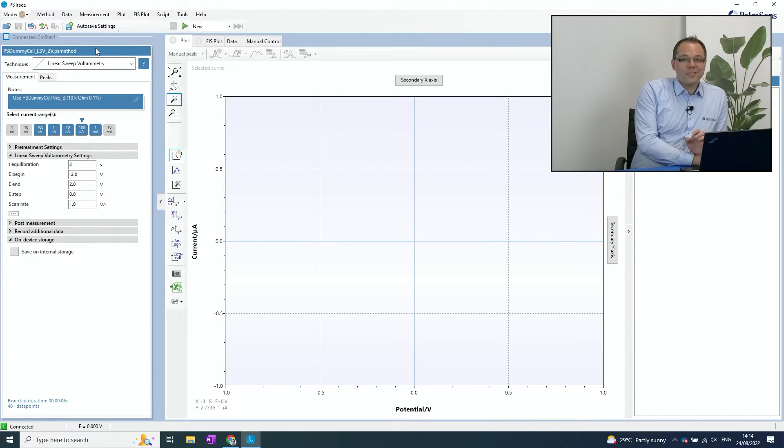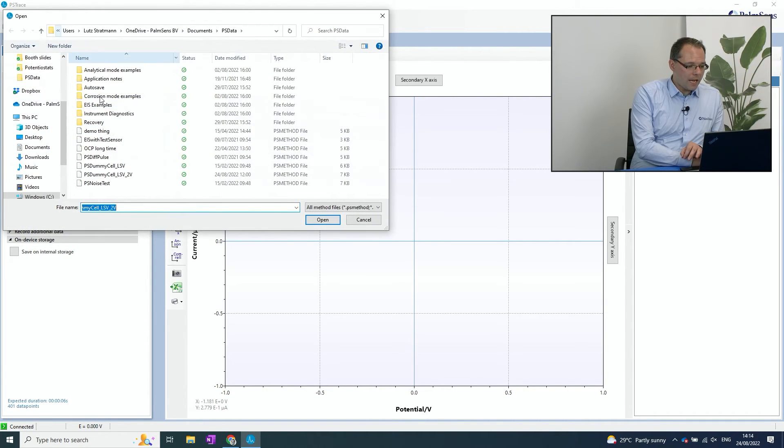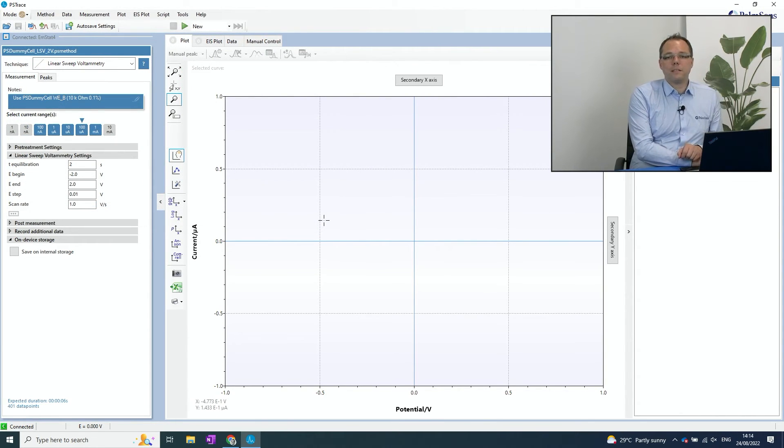So to set the parameters in the software for this first measurement, we will just load a method file. A method file contains all the parameters that you need for a measurement. It doesn't contain the data of a measurement itself. So to load such a file, I just choose Method, Load and pre-installed already in the Documents PSData folder, you will find the method file that we want to use today, which is PSDummyCell LSV 2V. I open that and all the parameters are already set for me. The only thing I have to do is press the Start Measurement button.